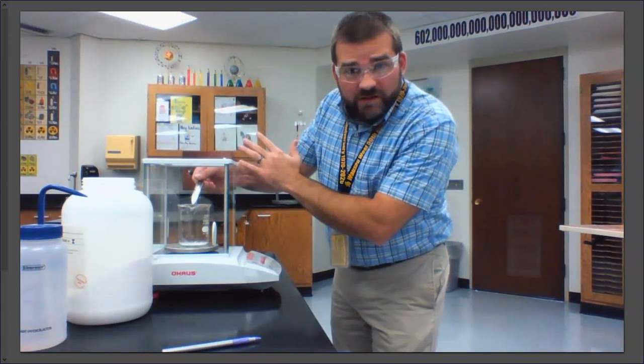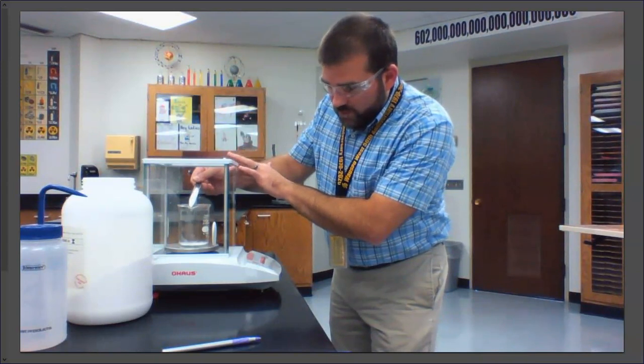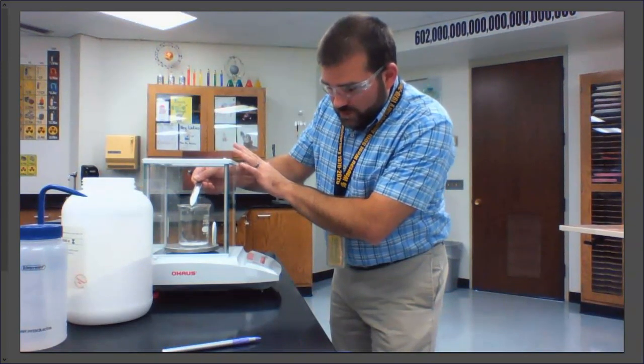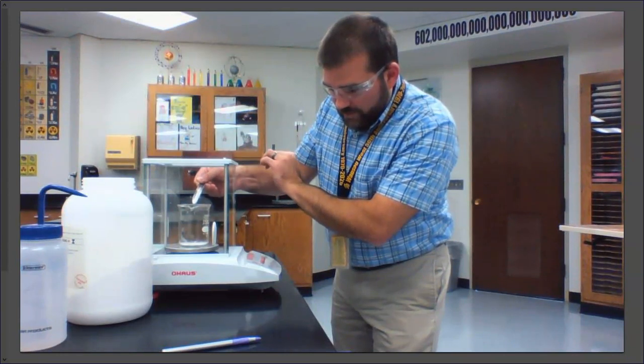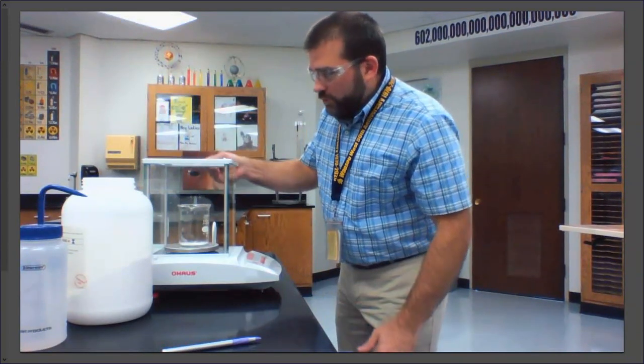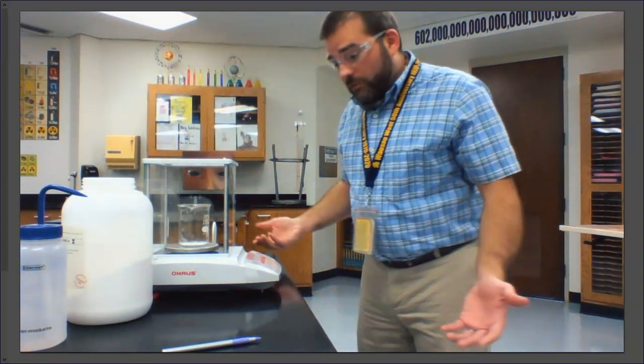I hope you're here eventually this year and we have a chance to do this for real, because it's an important lab technique that you'll use in your college chemistry class if you take chemistry in college. So I'm getting close. I slow down, lighter taps, and I'll stop right there. And I'll put the remainder back in my container, and I'll record what I've taken.